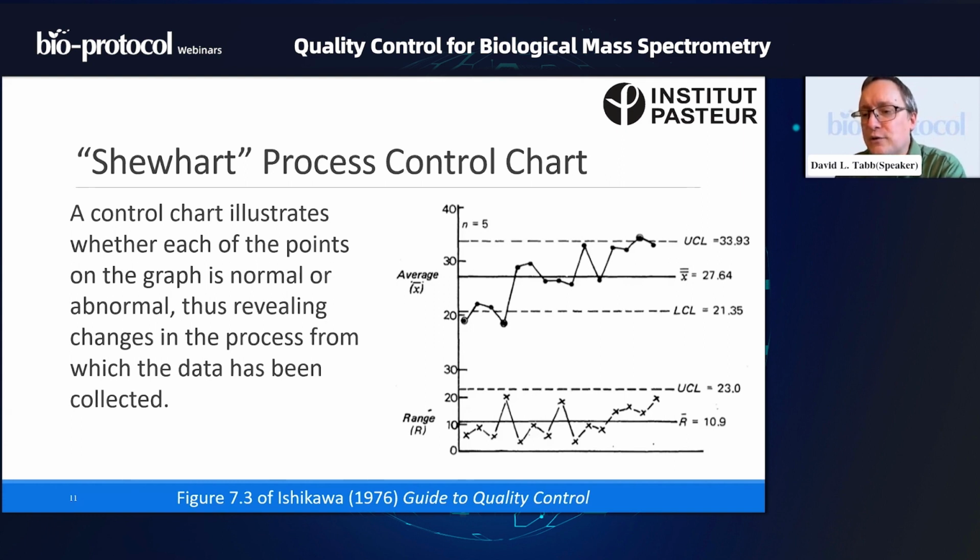But we also have these values of upper and lower control limits. That's a UCL and an LCL. So in this case, we have been able to look at the performance of this process day after day for a very long time. And so we have a very clear notion empirically of what a high value looks like and what a low value looks like. In this case, upper control lines and lower control lines act as our bounds of okayness. If the average falls above the upper control limit, we say it is out of control. If it is below the lower control limit, we say it's out of control on the low side.